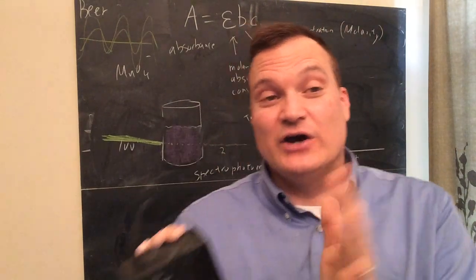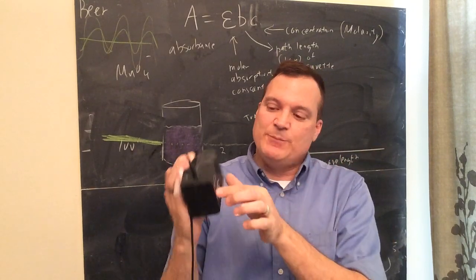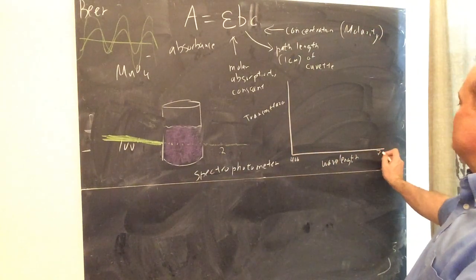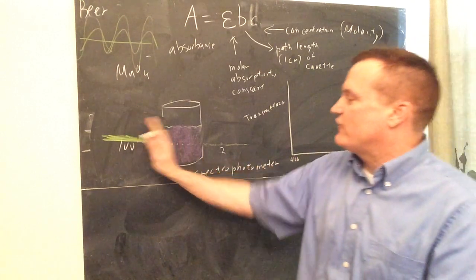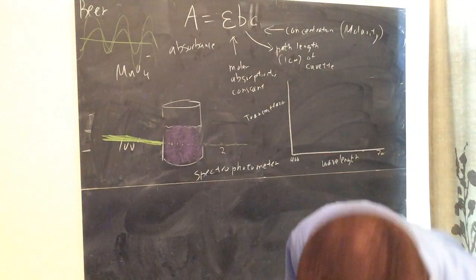But a good instrument, you could put any number like a dial. I could put 430, 431, 432, 433. You put any possible wavelengths. So we might just say that over here might be 400, and right here might be 700. And let's just say that with this machine, it's going to put every possible wavelength and shine it through this purple light.